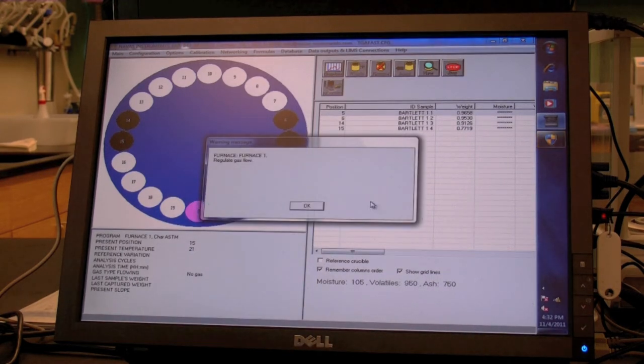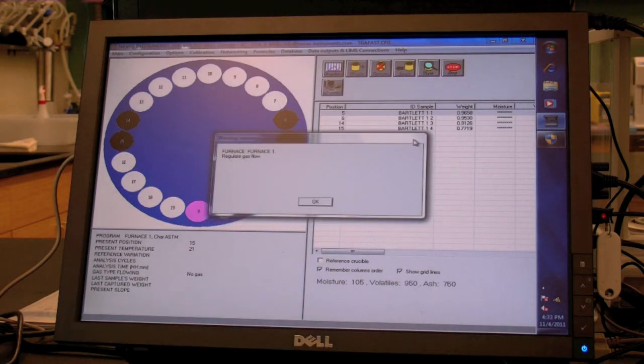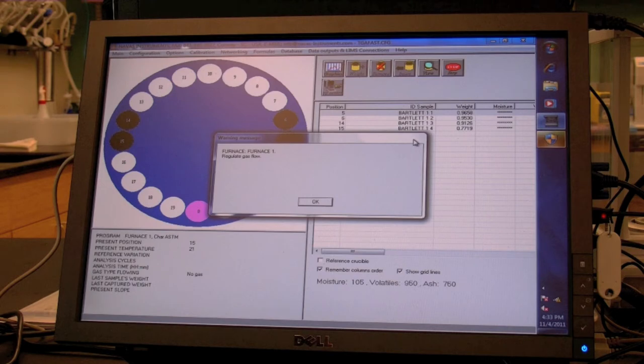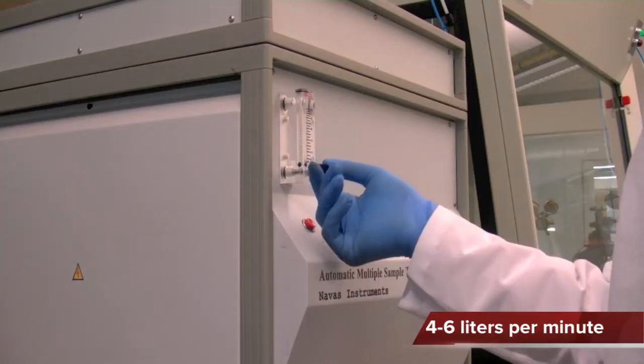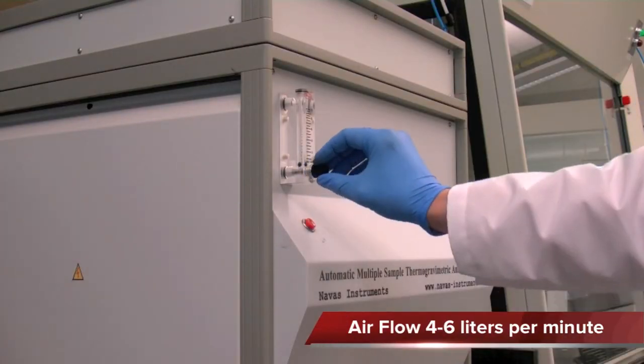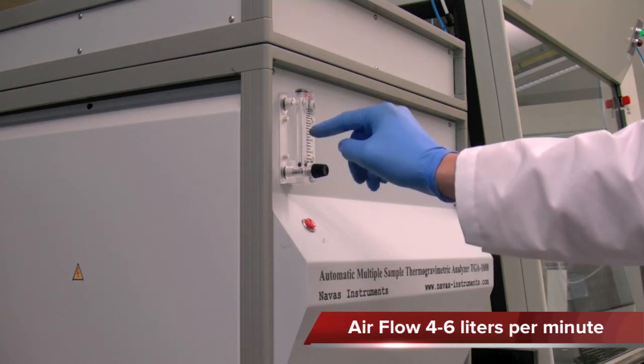Once the samples have been reweighed with the lid closed and the analysis is ready to run, click the Execute icon. A message will be displayed asking to regulate airflow. Adjust the flow meter on the front of the instrument to between 4 and 6 liters per minute and click OK.